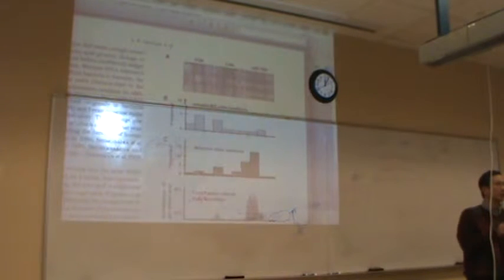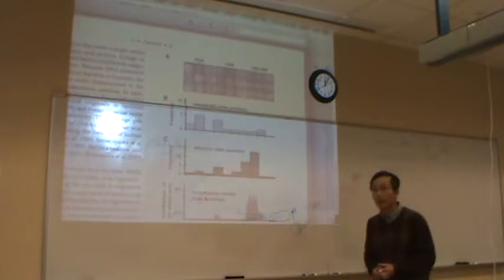Each group, write down the mutation you are studying. I'll figure it out. That's actually part of your assignment. Is it pSH44? No, that's not. No, that's your reporter plasmid. What about H81Y? H81Y? That's not right. That number is not in the right place. The format is correct, but the information is wrong.